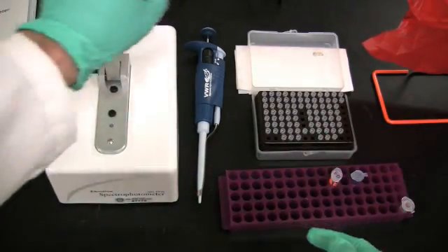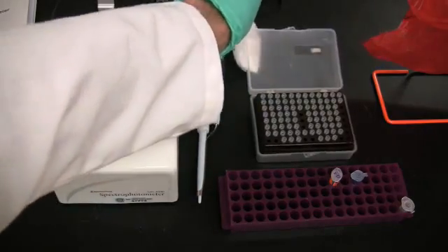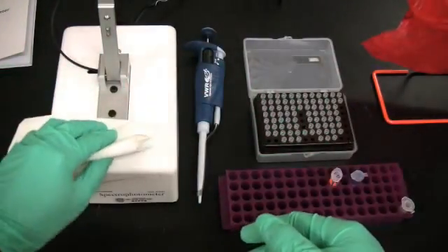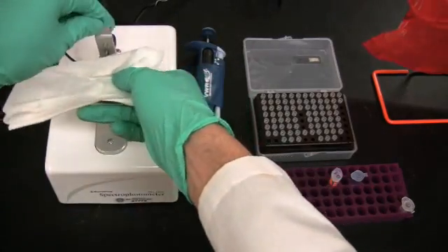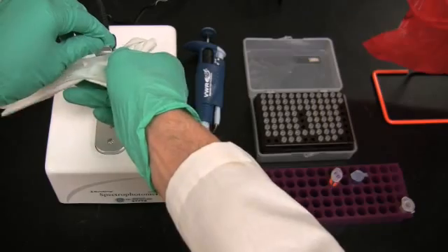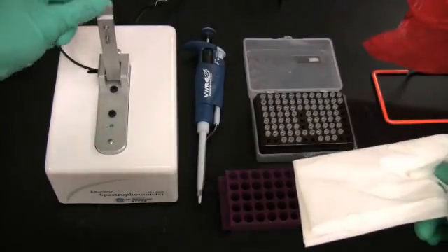Lift the sampling arm and gently wipe both the upper and lower pedestals with a laboratory wipe. Chemical wipes are preferred over conventional paper towels or napkins because they do not leave residue or fibers behind on the measurement surface, which could result in a faulty measurement.